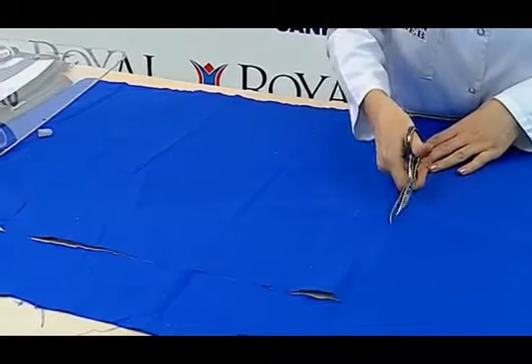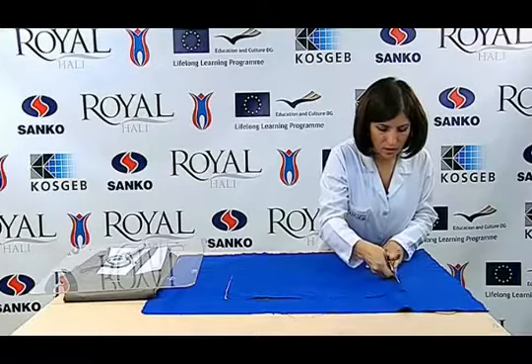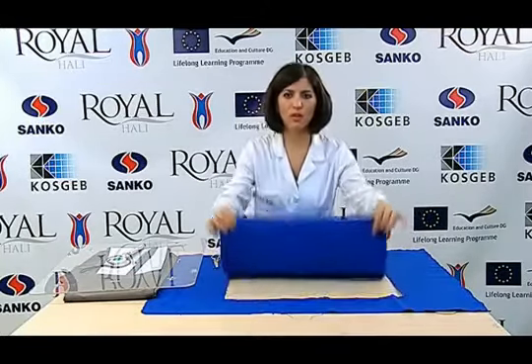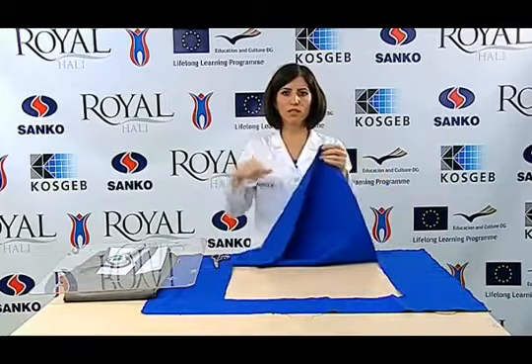The test sample is sewn on 4 edges with the overlock sewing machine to avoid unstitching before we put the sample inside the washing machine.